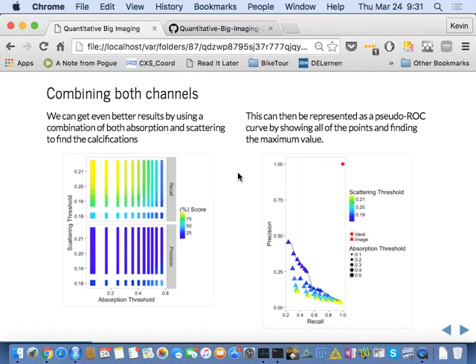And so these are the things that you have to think about and come up with, of how it makes sense to combine these data sets together, how you apply a threshold to it, and how you make this curve at the end. And once you've decided that, then you can let everything else be automatically determined. And of course, this is still not great, but it's much better than it was before.